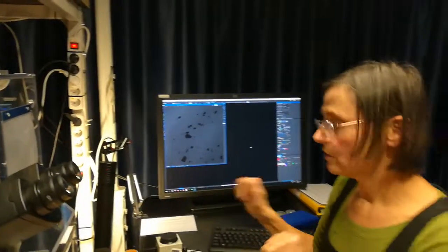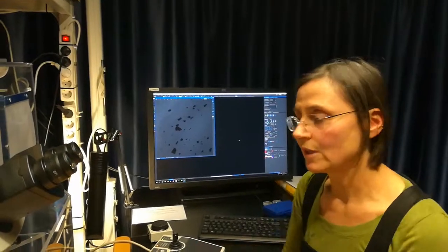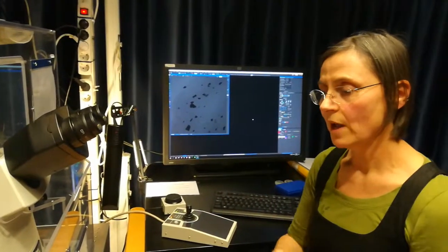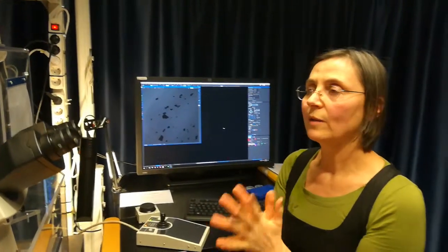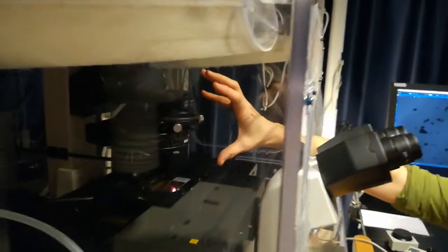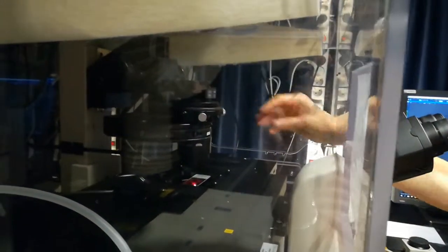I will not touch the focus anymore. This button is the same as the focus on the microscope — I will not touch the focus on the microscope anymore. What I'm going to do now is only take care of the condenser, which is this big blob here. Now that I am in focus, the number two thing I do is close the aperture that is here. On all microscopes, all these steps are exactly the same. You just need to identify the elements.